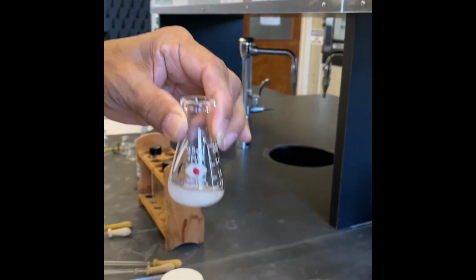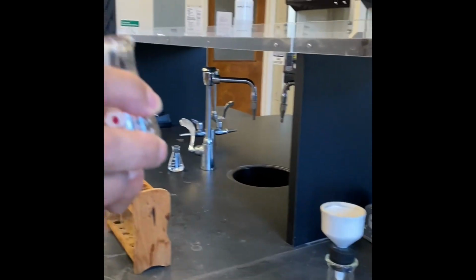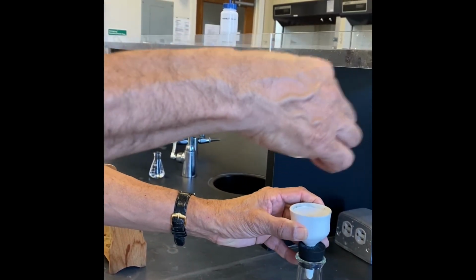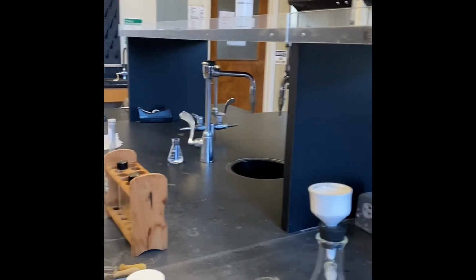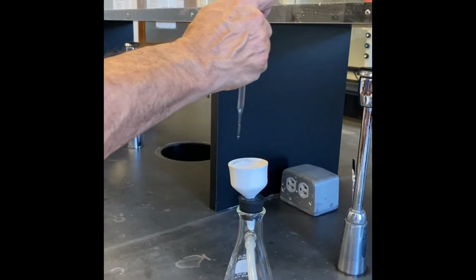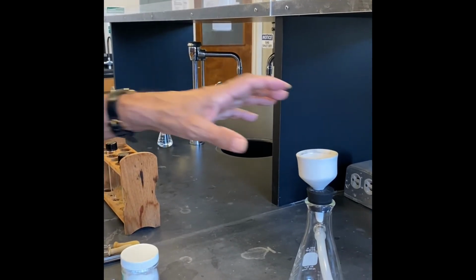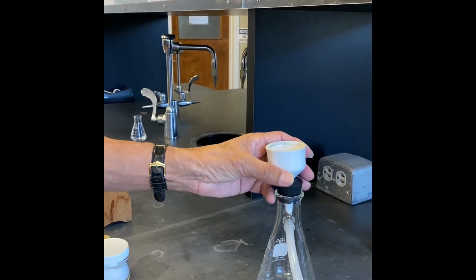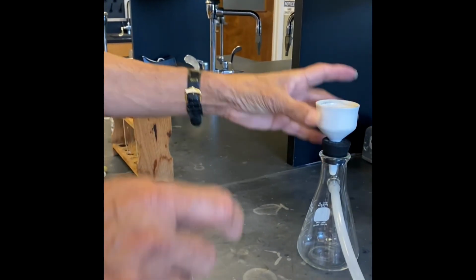And if you don't do that, what happens? Your liquid goes in the flask, whereas your compound stays back. So what you have to do is, when you filter it, you just swirl it, and as quickly as possible, dump it. And then, once you are done, you take a little bit of alcohol from the alcohol reservoir and wash the crystals with a minimal amount of cold alcohol. So then your compound is ready. You transfer that, the filter paper and everything, into your flask here, and you take a melting point.